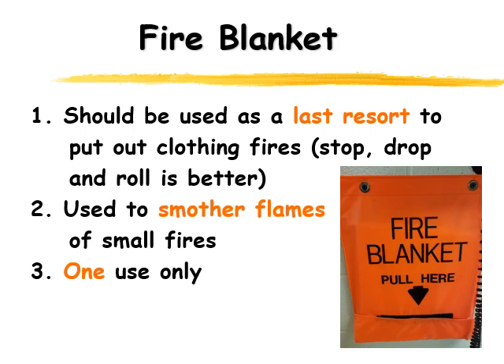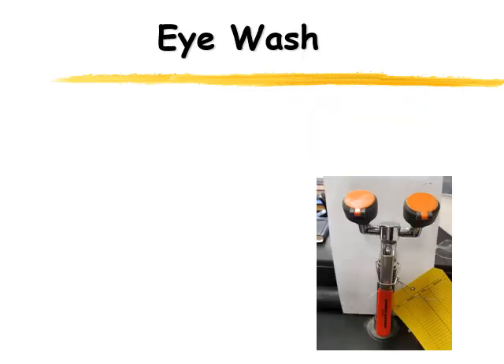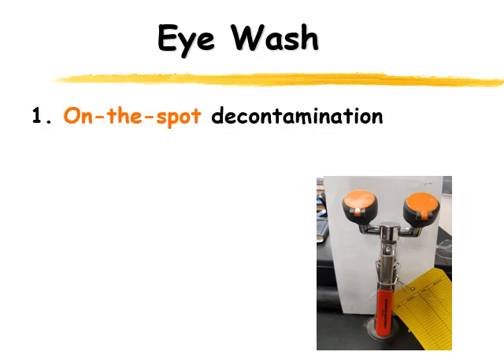The next piece of equipment is the eye wash. You'll notice the eye wash has a tag on it — that tag tells you the eye washes are inspected regularly, weekly, to make sure the temperature of the water coming out is not too hot and not too cold, but perfect for your eyes. They're important for on-the-spot decontamination, so if in the lab you end up with something in your eye, we can flush it right away.